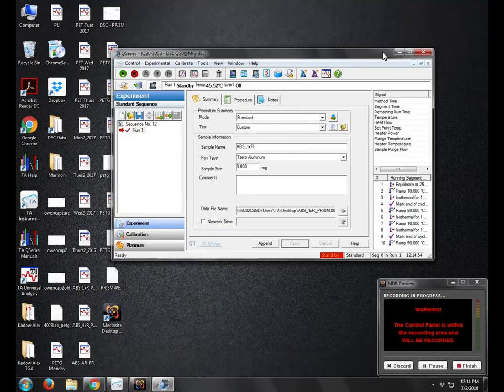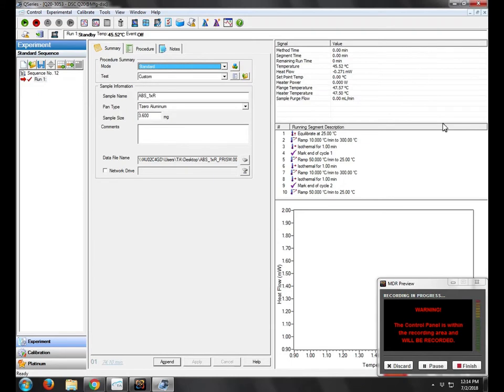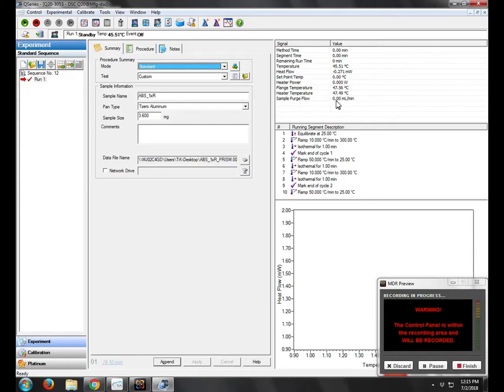Now that this instrument is connected, we'll maximize this screen. You can see all the parameters that are being recorded here. You'll notice that sample purge flow is at zero milliliters per minute, and you might get a pop-up that tells you that the flow rate is not being met. So now we'll go turn on the nitrogen tank, and we'll see that increase to 50.